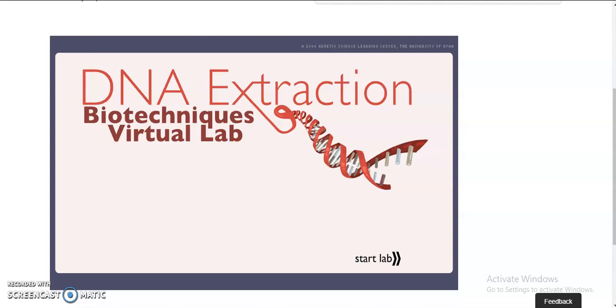First of all, I will explain about DNA extraction. DNA extraction is a routine procedure used to isolate DNA from the nucleus of a cell. When ice-cooled alcohol is added to a solution of DNA, the DNA precipitates out of solution. If there is enough DNA in the solution, I will see a streaky white mass.